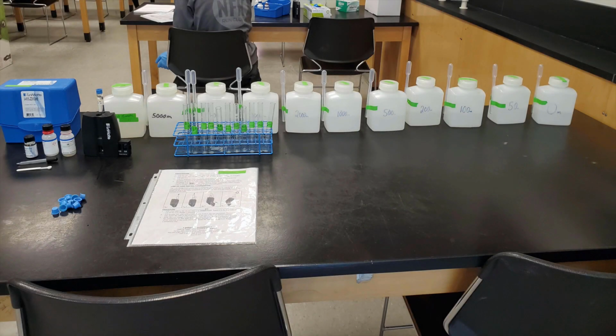As you can see from these bottles, we have samples taken from 10 different depths: 0, 50, 100, 200, 500, 1,000, 2,000, 3,000, 4,000, and 5,000 meters, as well as a single sample taken from the Elizabeth River at 0 meters that we will call natural surface sample. You will want to write these depths in your table, starting with 0 meters at the top and ending with 5,000 meters at the bottom.